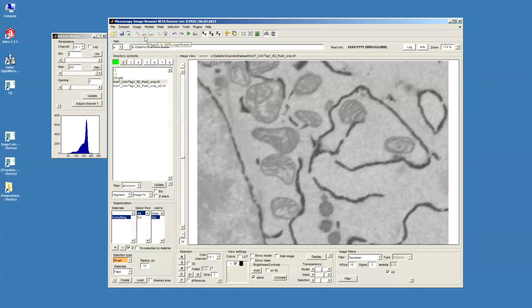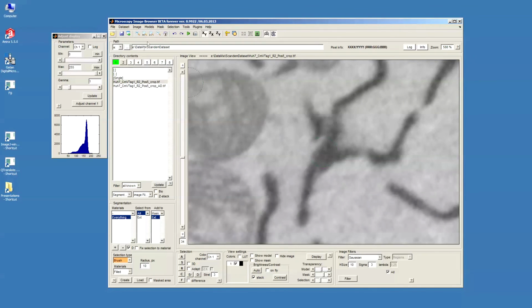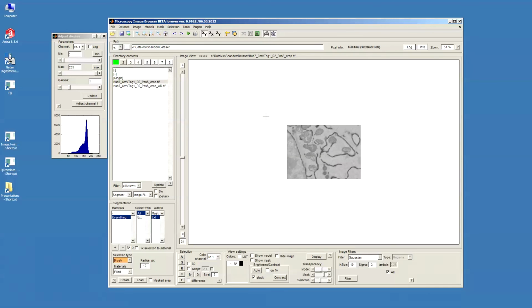The next set of buttons are defined in order to magnify the image, which is in a way similar to the use of the W button, or set the image 1:1, pixels on the screen to pixels of the dataset, stretch to image axis, and then zoom out, which is similar to the Q button.